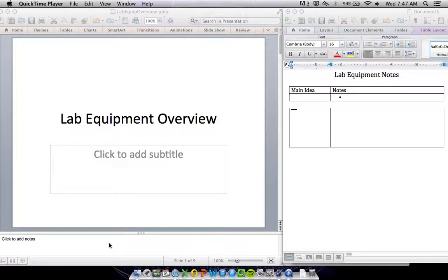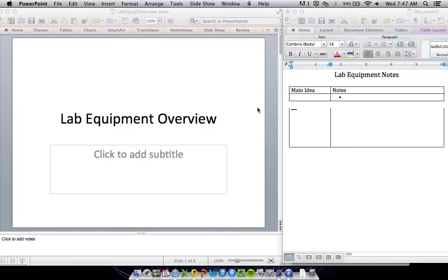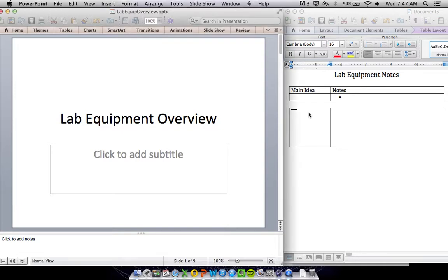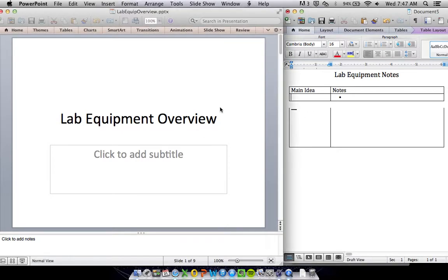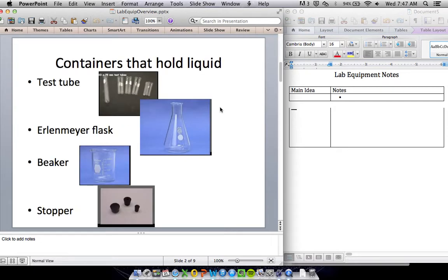Today we'll cover lab equipment and what it's used for in science class. This is an overview of the main lab equipment we're going to be using this year and what it's used for. Let's get started.